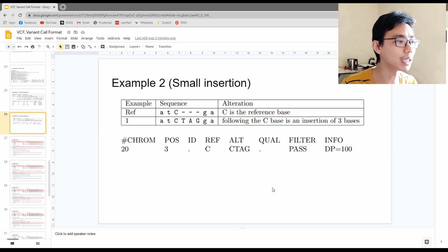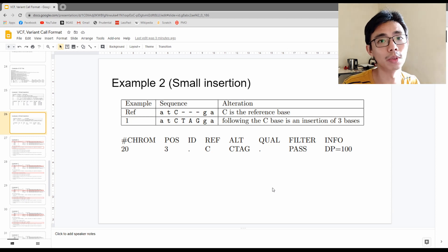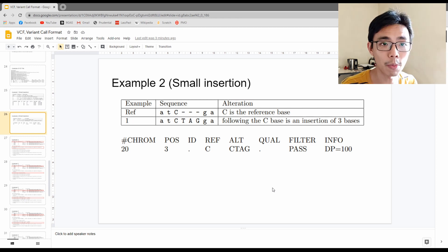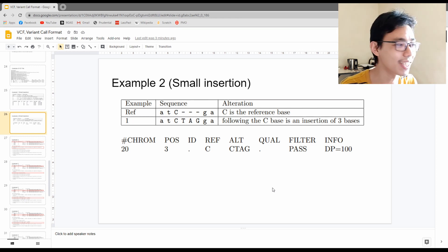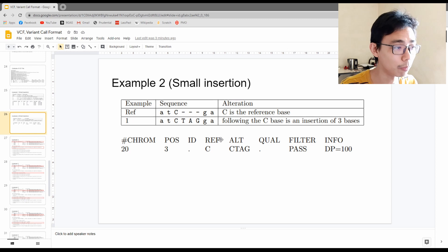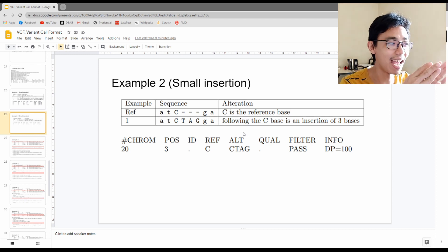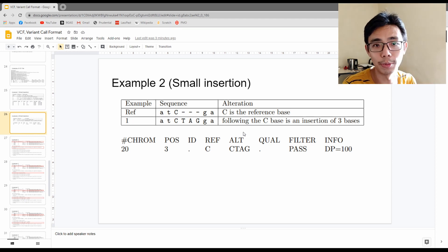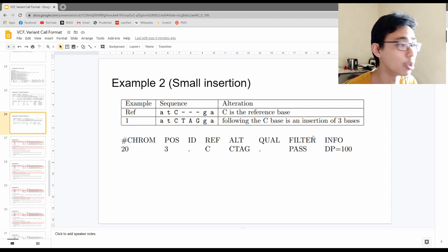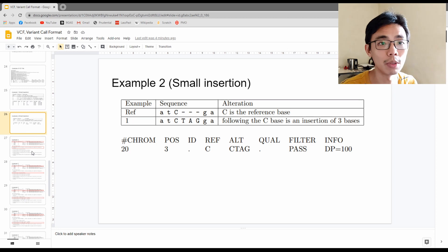There are also cases of multi-nucleotide insertions — more than one nucleotide at a time. In this case there is a three-nucleotide insertion on chromosome 20 at position three, with no matching ID. The reference is just a C, while the alternate is CTAG, giving us a three-nucleotide insertion. It passes the filter and has a read depth of 100, so we know it is a significant change to investigate.